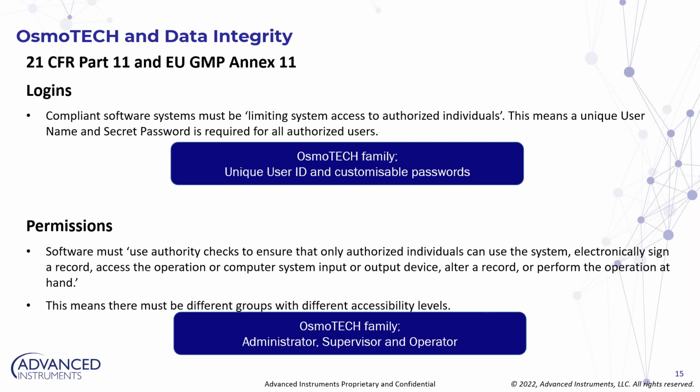You can customize that. Also, more and more in the industry, what we're seeing is administrators becoming more like IT people who help in setting up the device, making sure it's configured correctly, making sure it's connected to the network. But you really don't want them running a test. You really don't want them going in and performing a calibration, right? You want them to be non-influential third-party people, not involved directly with the device's performance from a testing perspective. You have the ability to do that on the device by simply turning off a feature. You can disable the administrator from performing a test, but they can take care of everything else on the instrument.